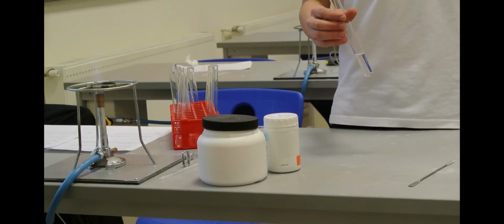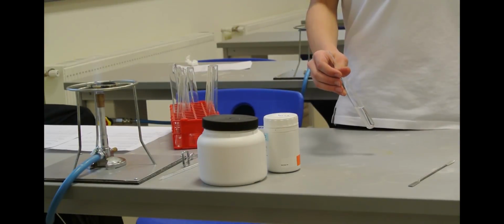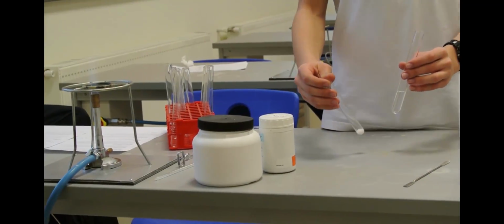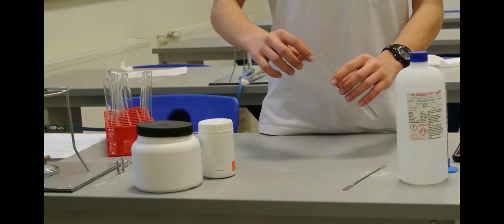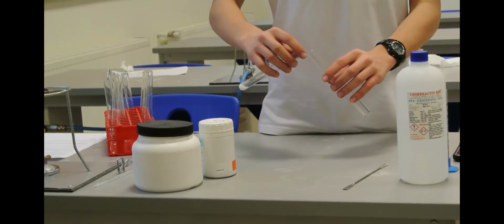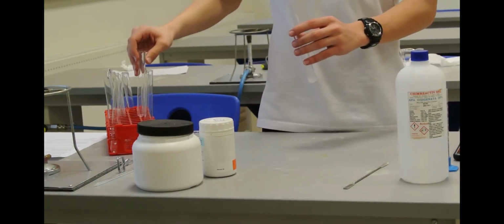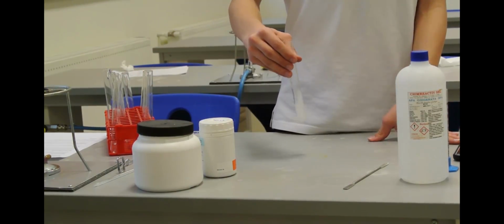Okay, so I have 10 milliliters of hydrogen peroxide in this test tube, and I am going to add around 4 spatula measures of sodium potassium tartrate to it. Right, and I'm just going to stir it till it dissolves.